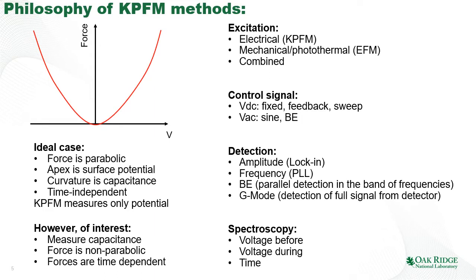So the sinusoidal excitation with lock-in amplifier is the classical KPFM, sinusoidal excitation with the phase lock loop detection is the frequency modulation KPFM, and band excitation is the band excitation KPFM.